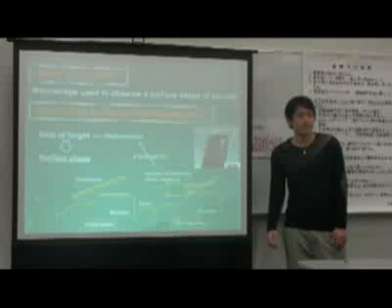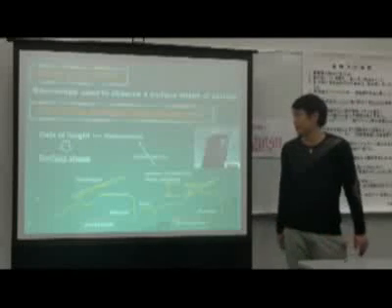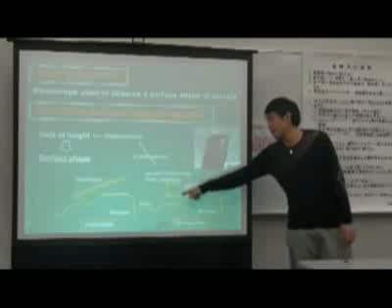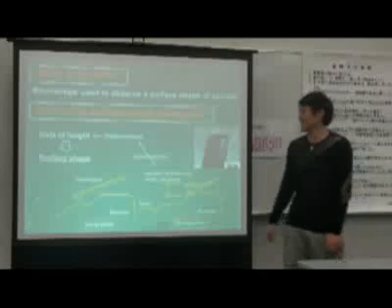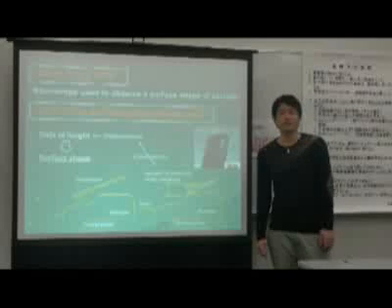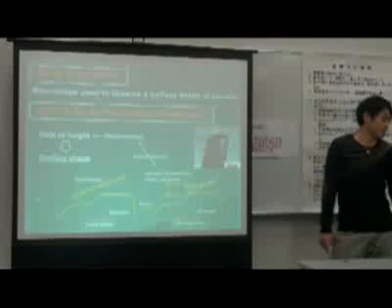Scan means the cantilever goes over the sample surface, and then the Z-axis is controlled to reduce this amount of deflection. This control value is measured as displacement, and it becomes the height data, which becomes the surface shape.